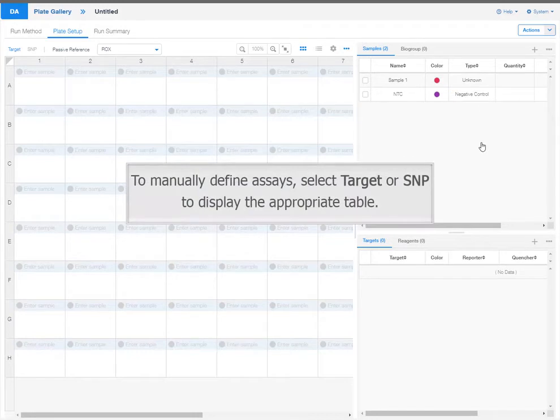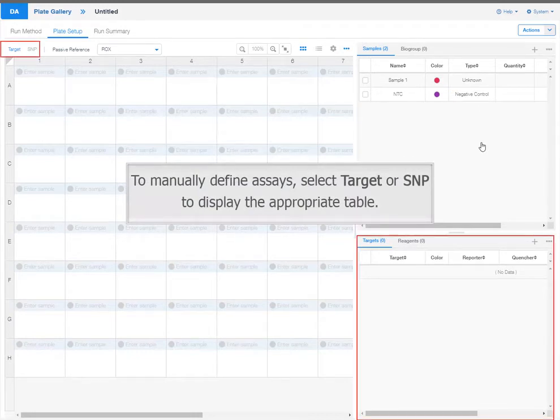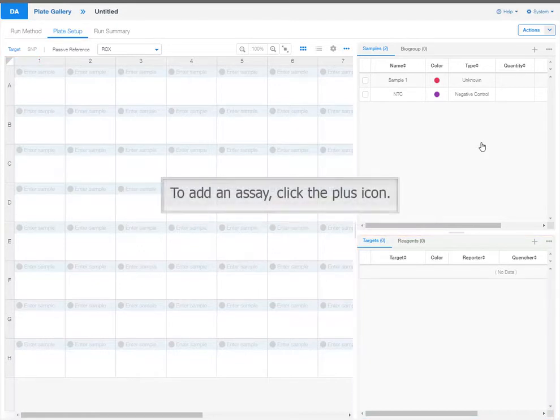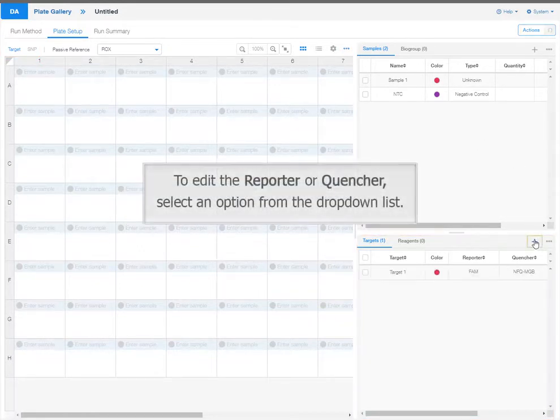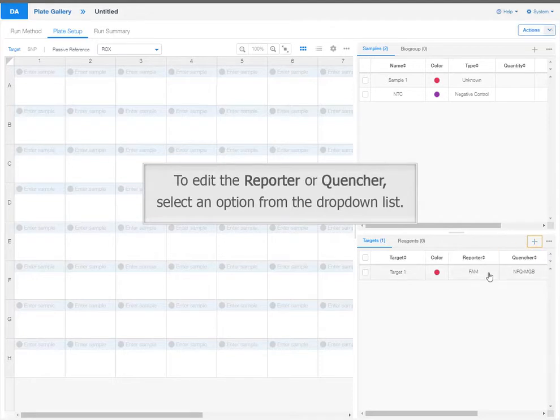To manually define assays, select target or SNP to display the appropriate table. To add an assay, click the plus icon. To edit the reporter or quencher, select an option from the drop-down list.